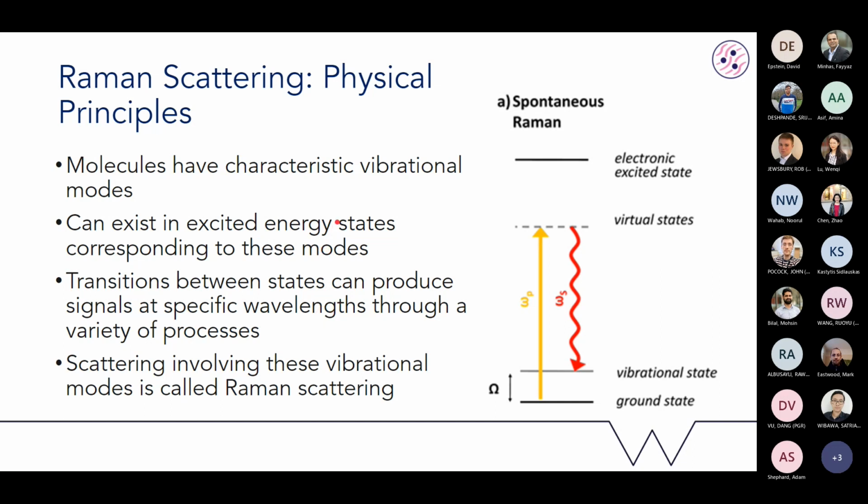So when you shine a light at your sample, it will briefly be excited into something called a virtual state that it cannot really properly exist in. It's a very fleeting state that then mostly transitions back down into the ground state, and you get the more common elastic scattering that, for example, results in the blueness of the sky.